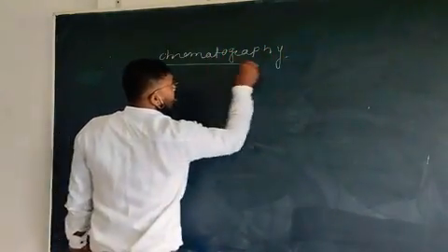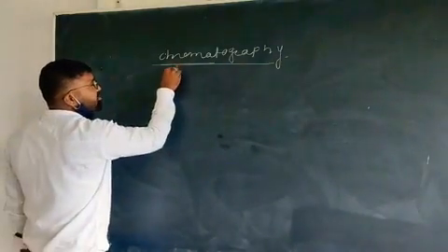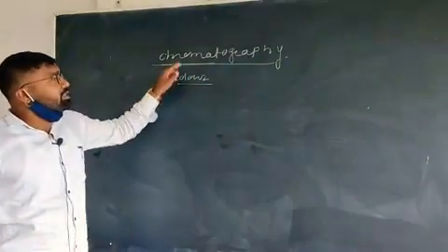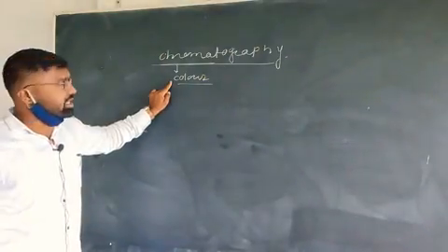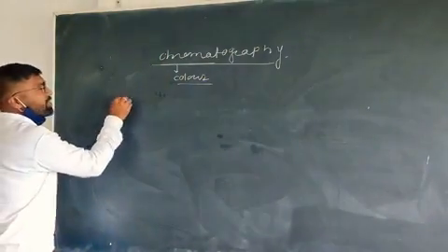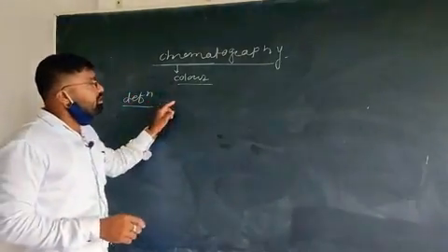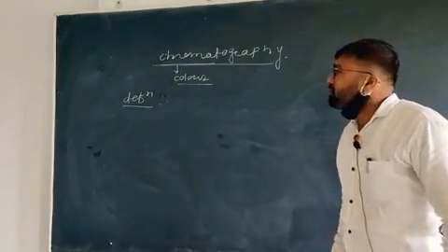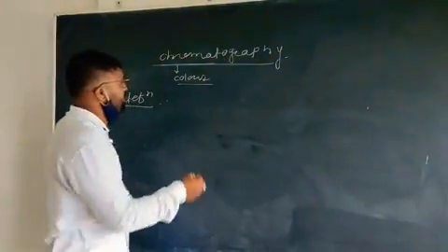So, what is chromatography? Actually, this is a Greek word, chroma stands for color and graphy means analysis. That means chromatography is nothing but the analysis related with color. If according to analytical chemistry you have to define chromatography, then the definition is, it is a physicochemical, or you can say physicobiological technique, or simply we call it a technique.